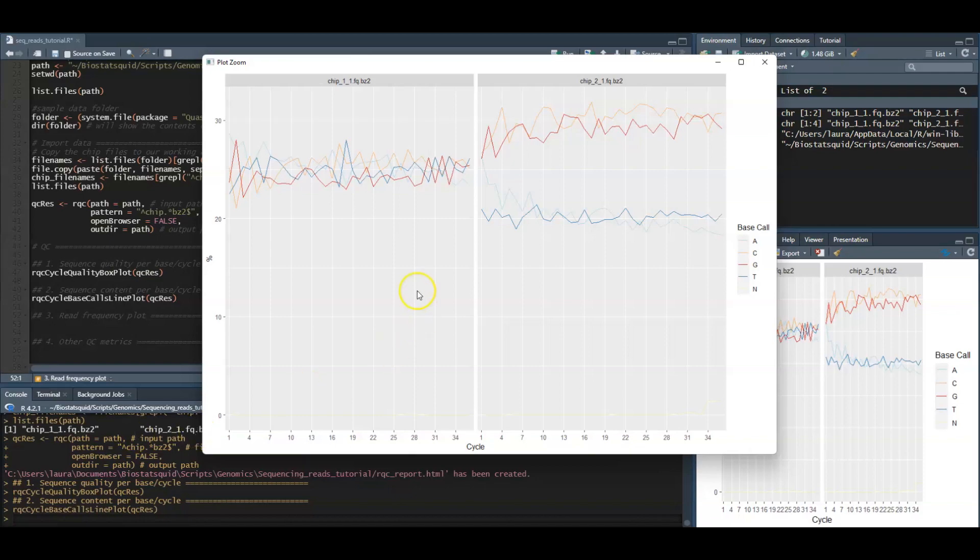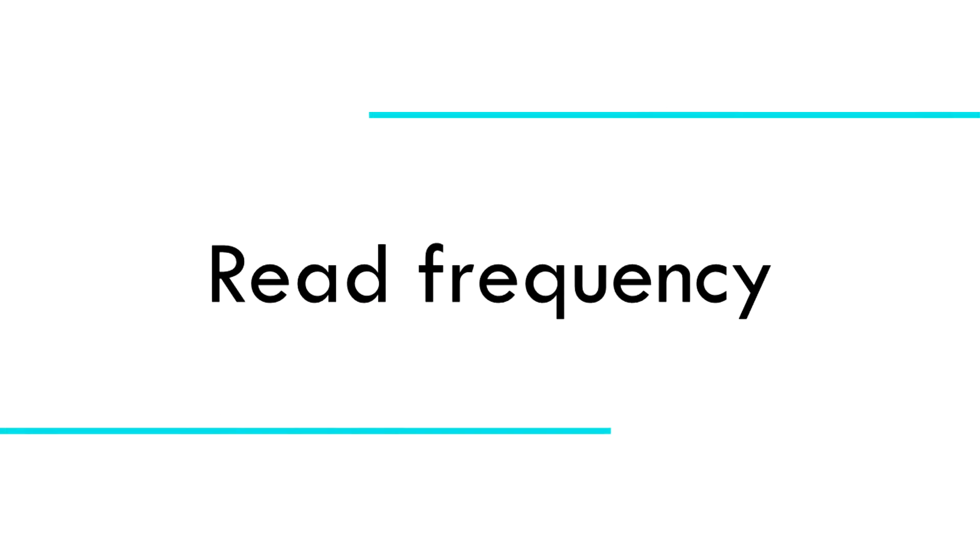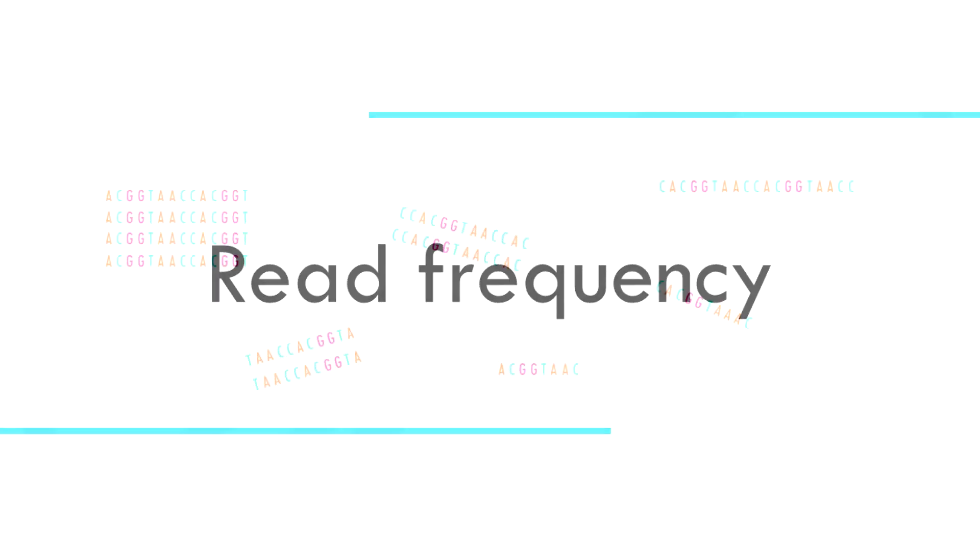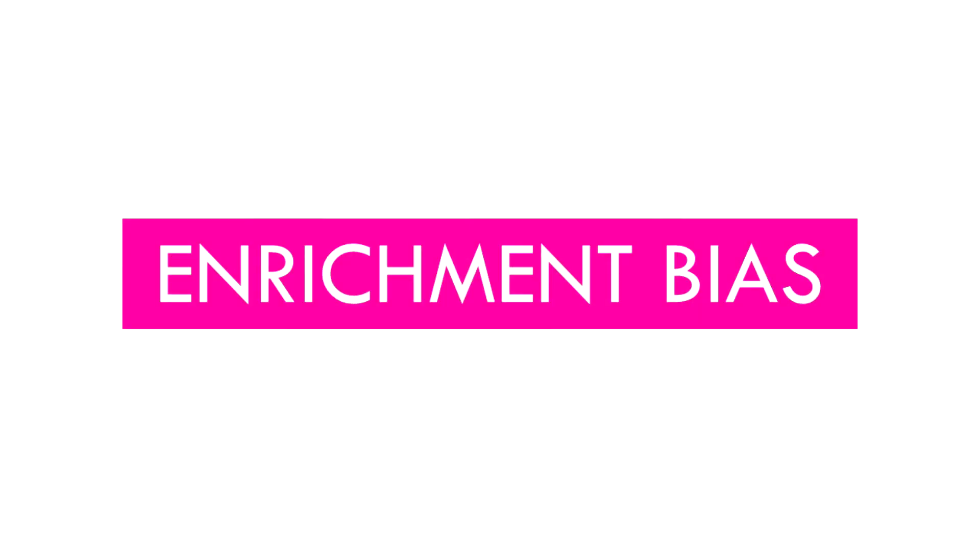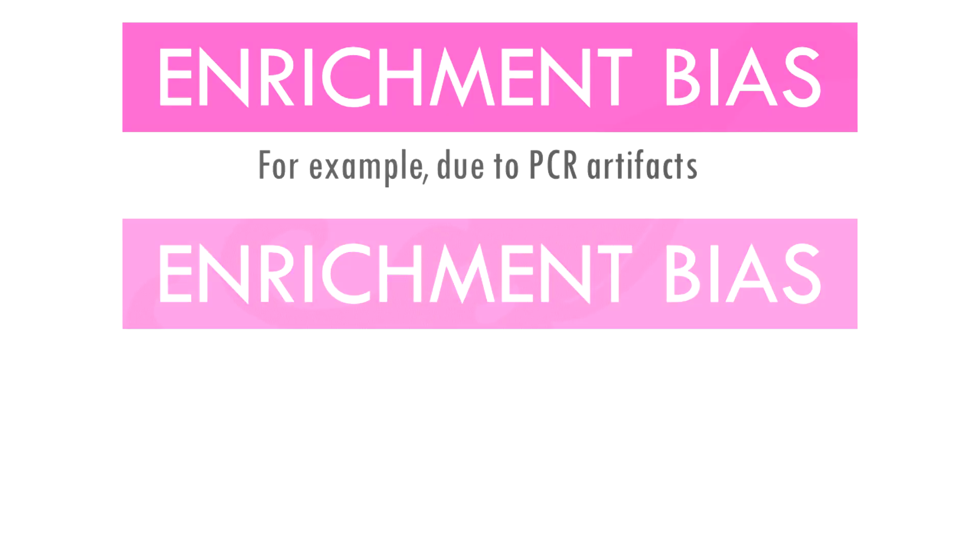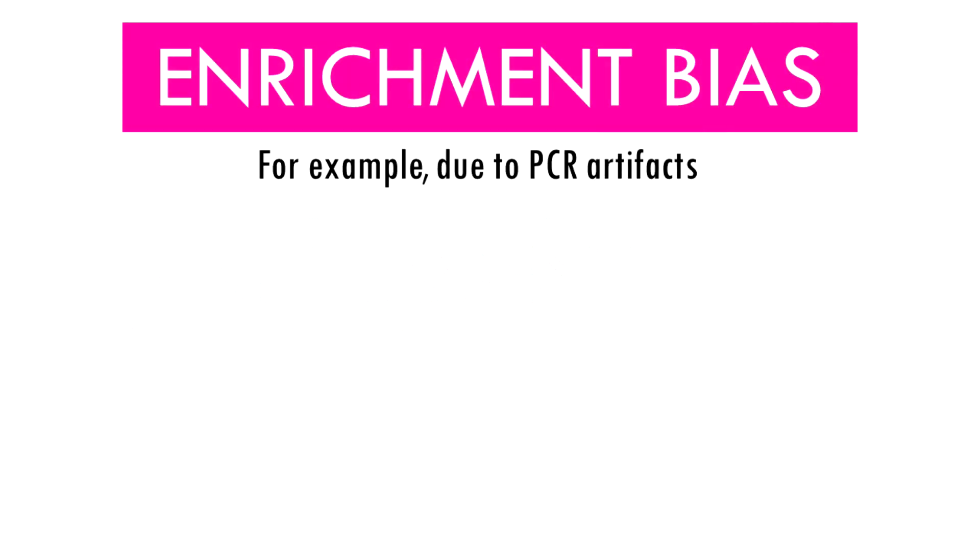The read frequency plot shows the degree of duplication for every read in the library. A high level of duplication or non-unique reads is likely to indicate an enrichment bias, basically that we have a high proportion of the same sequence. This could be due to PCR artifacts that can cause technical duplicates.